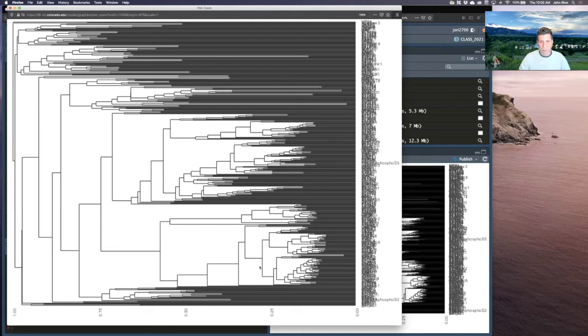In fact, it looks like we have 3 distinct groups, one down here, one sort of in the middle, and one over here. And what we can see, because of its longer name, is this is POL2 phospho S5. I have all of this in the markdown in the RMD, so don't worry, or just ignore me for now. And POL2 phospho S2. These are very different forms of the polymerase, and they should not be clustered together. And so we'll take a look at them at the end and just see if this makes any sense. But this is kind of fun because we're starting to see our data all together for the first time, and we're going to get to see if it makes sense in just a couple minutes.